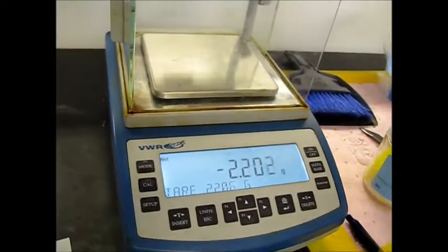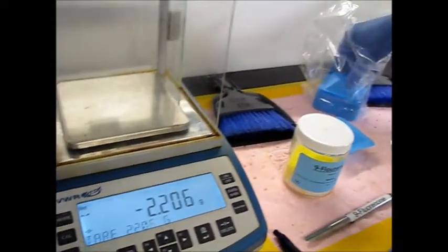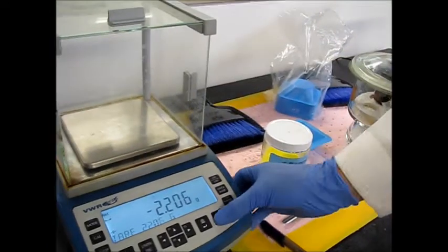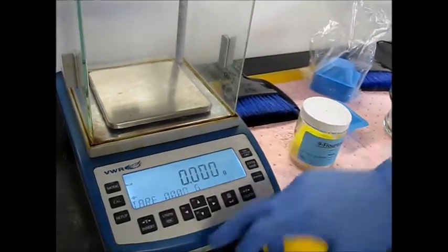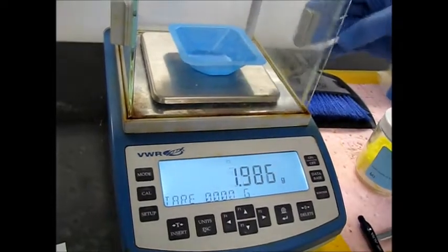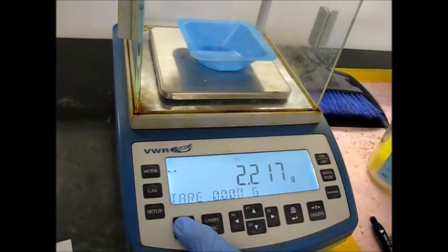Now we're going to weigh out 50 milligrams of the sodium borohydride. So once again, we need to make sure we zero first. And tare.